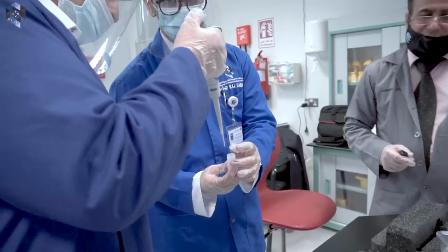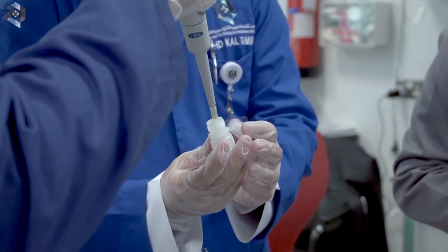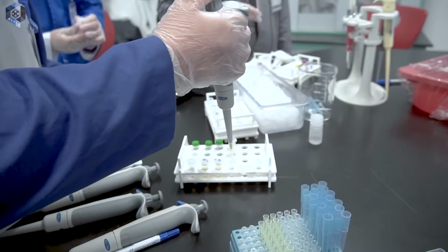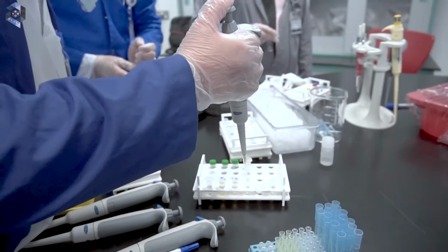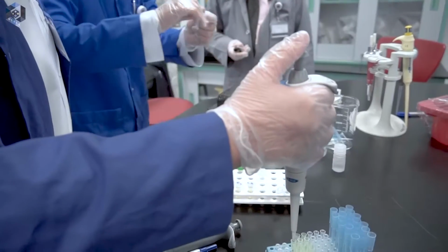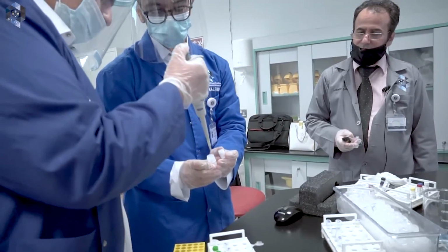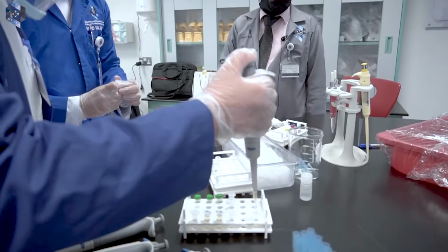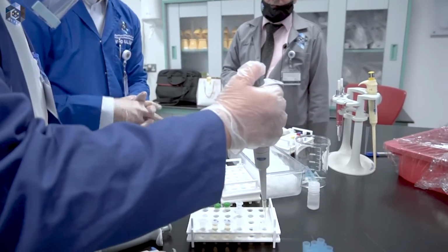Take 45 and add them to the tubes where you just added the DNA. Add here and here. Okay, good. Now discard the tip. Take another tip. Add another 45 microliters to the other centrifuge tube. Okay, very good. Discard the tip.